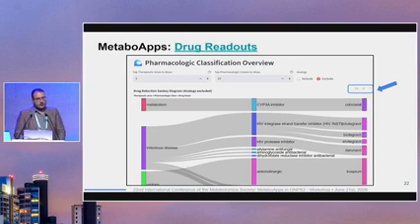Okay, so the drug readouts have two separate libraries, and you can access them combined or separately. In this case, the analogs are structural information of compounds that have minor modifications, but are not exactly the parent drugs.